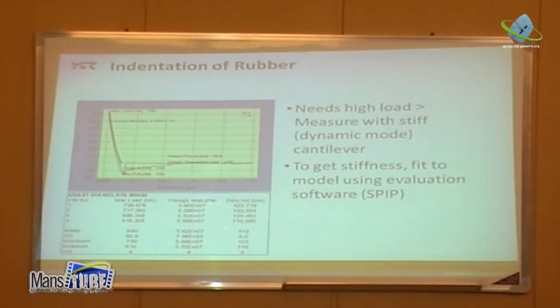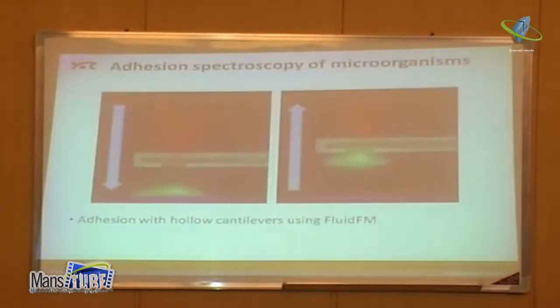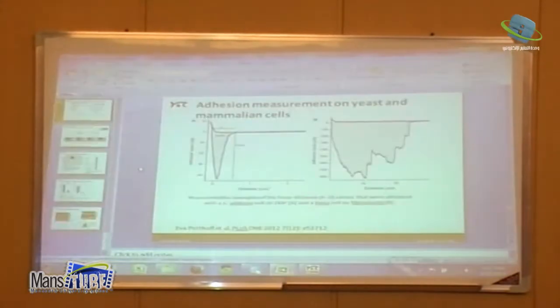Yeah. And also, we can get the indentation modulus. So when you have the spectra here, you can measure the indentation depth. I mean, how much you indent in the material. And maybe we can talk later about that. Okay. Yeah. And I would say this is basic spectroscopy. So now we can show something, and then when you measure, you will understand it better. Okay.